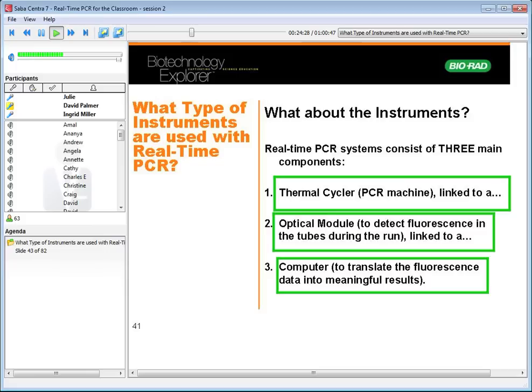Melt curves right now have been taken even further with this new field of precision melt analysis, or sometimes called high resolution melt. And in that, a regular melt curve is done with a precision instrument and reagents that bind to every available spot on the DNA. The melt curve is done. It's then normalized. So the starting fluorescence and the ending fluorescence is the same for the melt curve. And then it can be normalized for temperature again in the software.